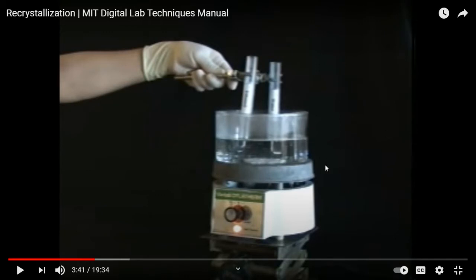So again, during the practical test or other lab classes we do together, if I watch you holding these test tubes with a bare hand, or even with gloves, that's not the proper way. You gotta have some sort of clamp or heat insulating tool.